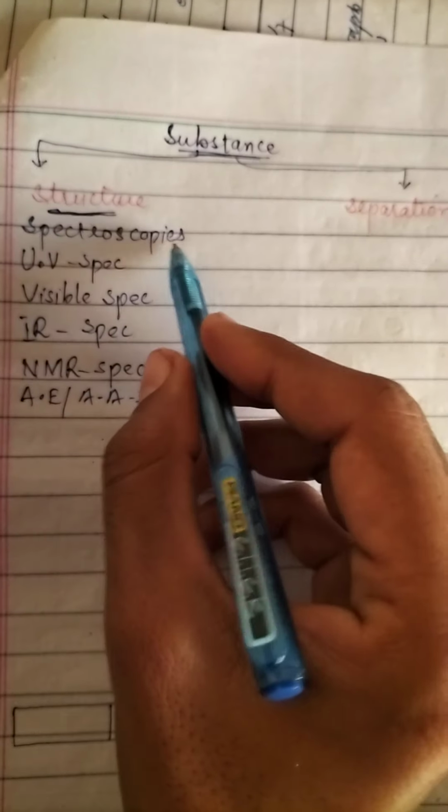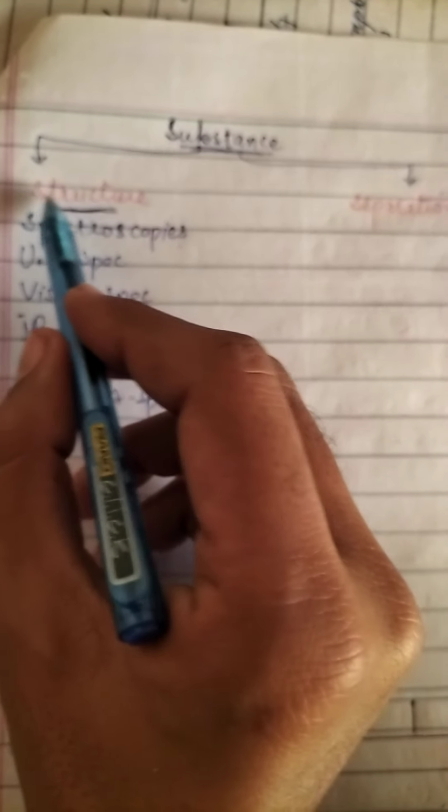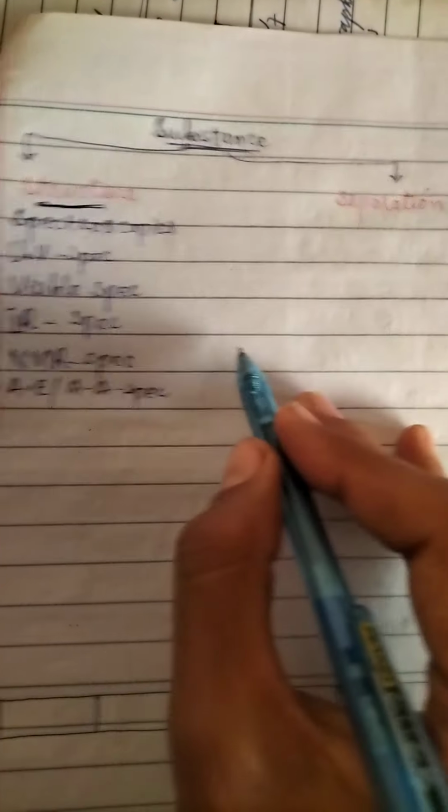These are the spectroscopies that can be used to determine the structure of the substance.